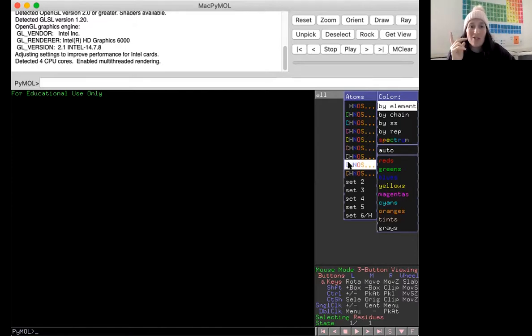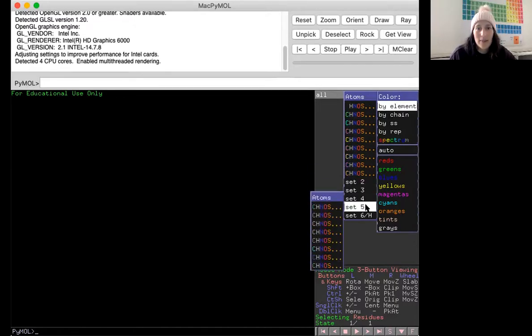Sulfur is orange. Hydrogens are white, but usually in X-ray crystallography, there's a limit where you can't see the hydrogens. If you solve your structure using NMR, you can see the hydrogen. So it's okay if you made your carbons white, because most people don't really look for those hydrogens anyways. I mean, we kind of go hydrogen blind a little bit when we're looking at these structures. Okay. And notice that the C is the color carbon, right? And there really isn't like a true blue or a cherry red. Maybe in some of these further sets you might find it, but they really hold off on trying to mess up that convention.